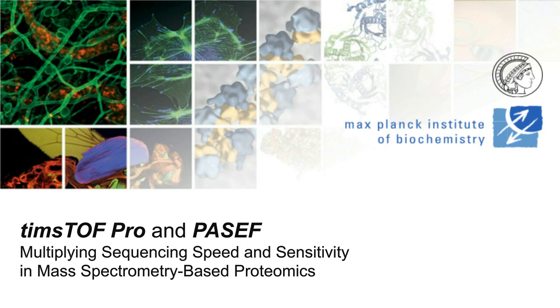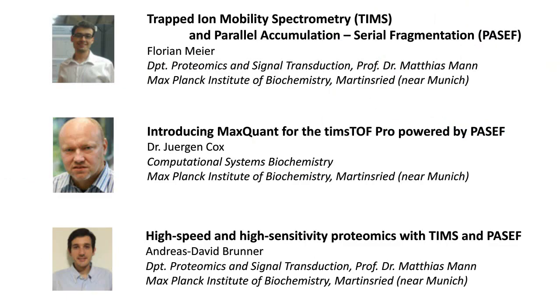Hello everyone, and thanks for joining our webinar on the timsTOF Pro and PASEF, which we use to multiply sequencing speed and sensitivity in mass spectrometry-based proteomics. We have divided the talk into 3 chapters. So Florian, it's me, will start with a background on the technology and how the PASEF method was developed. Then Jürgen will take over and give you an introduction to MaxQuant and how it handles the 4-dimensional feature space produced by the timsTOF. And Andreas will finish with applications of the timsTOF Pro for high-speed and high-sensitivity proteomics.